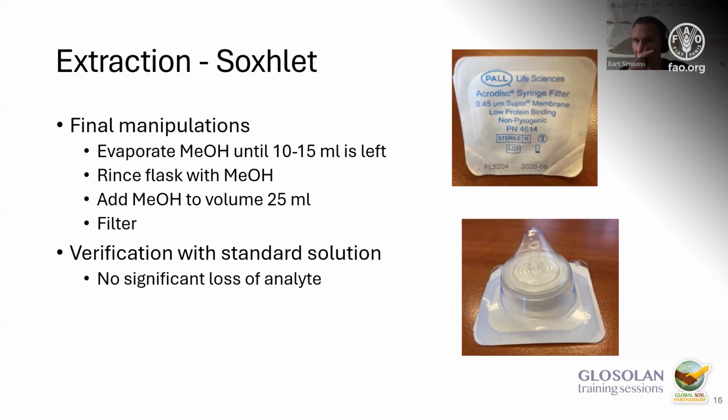Now, there's one more thing that we did because of a discussion that we had. Someone was asking, if we evaporate the methanol after the Soxhlet extraction, are we sure that none of the explosive molecules are leaving the solution?